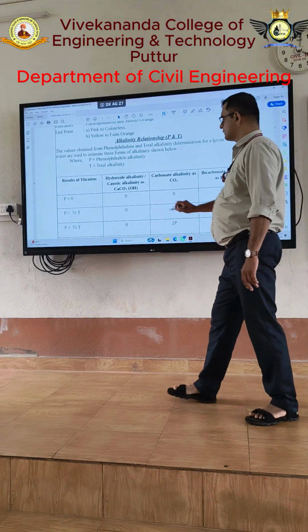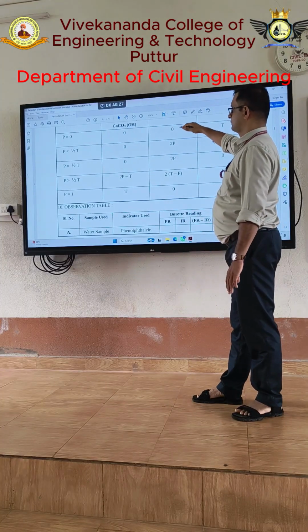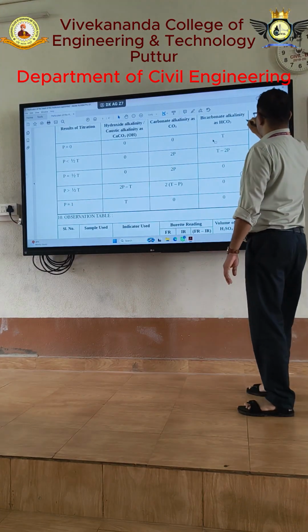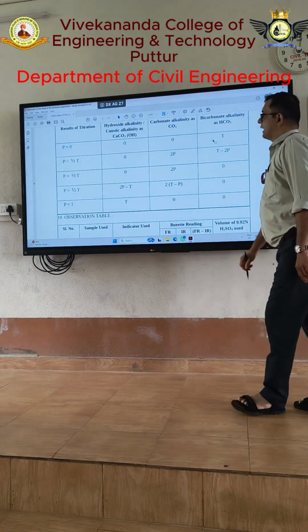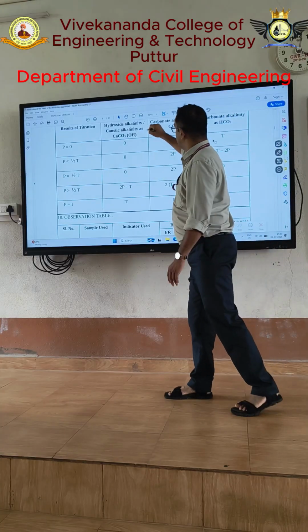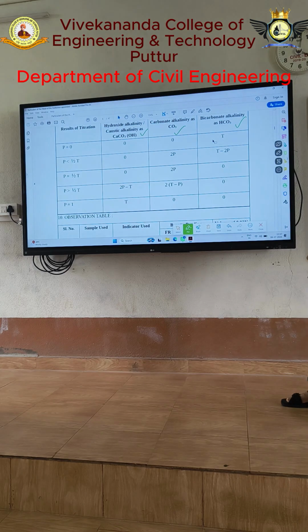Now say here, I have to calculate what is the hydroxyl alkalinity, then what is the carbonate alkalinity, what is the bicarbonate alkalinity.